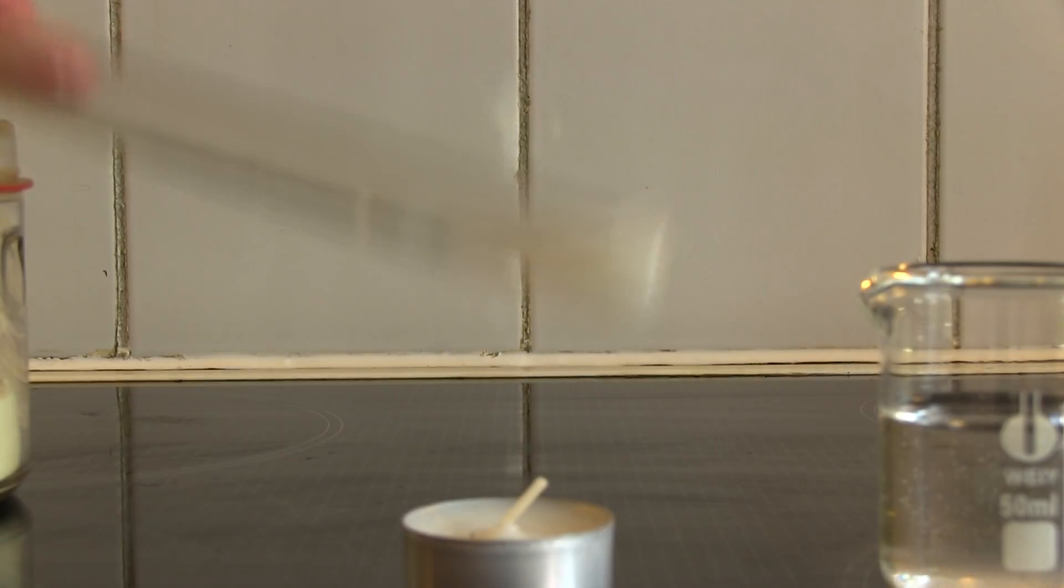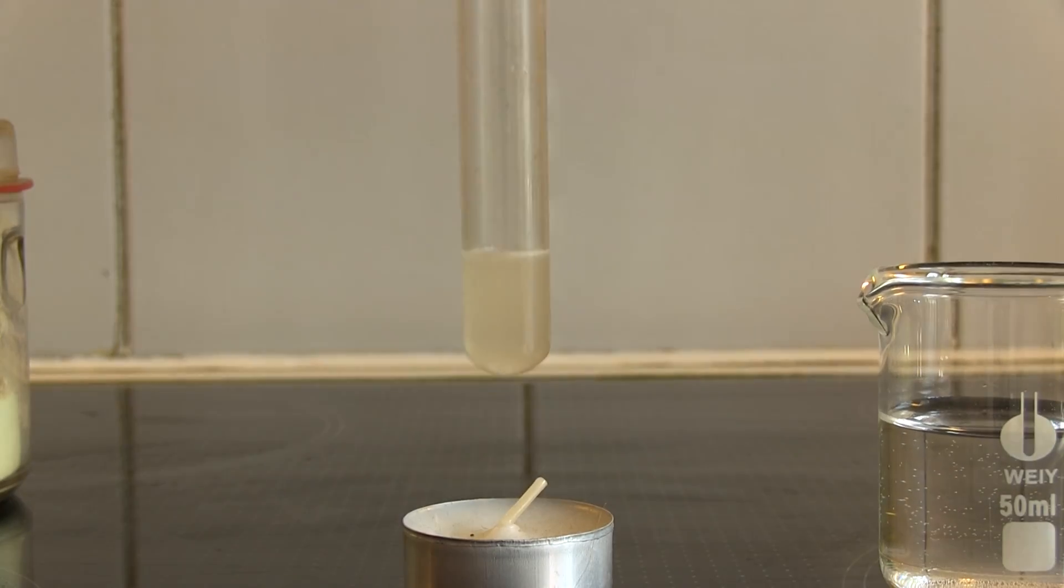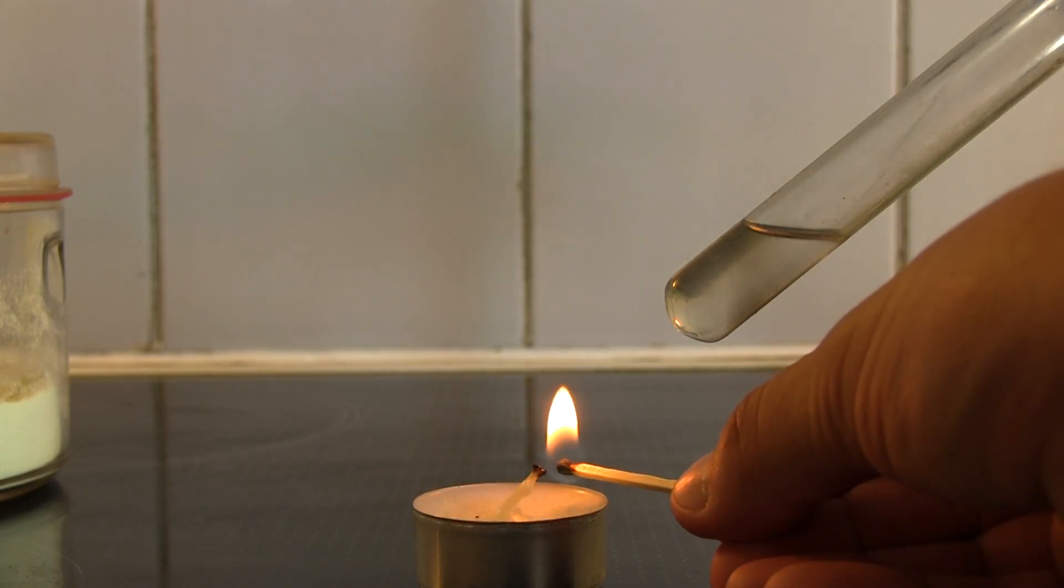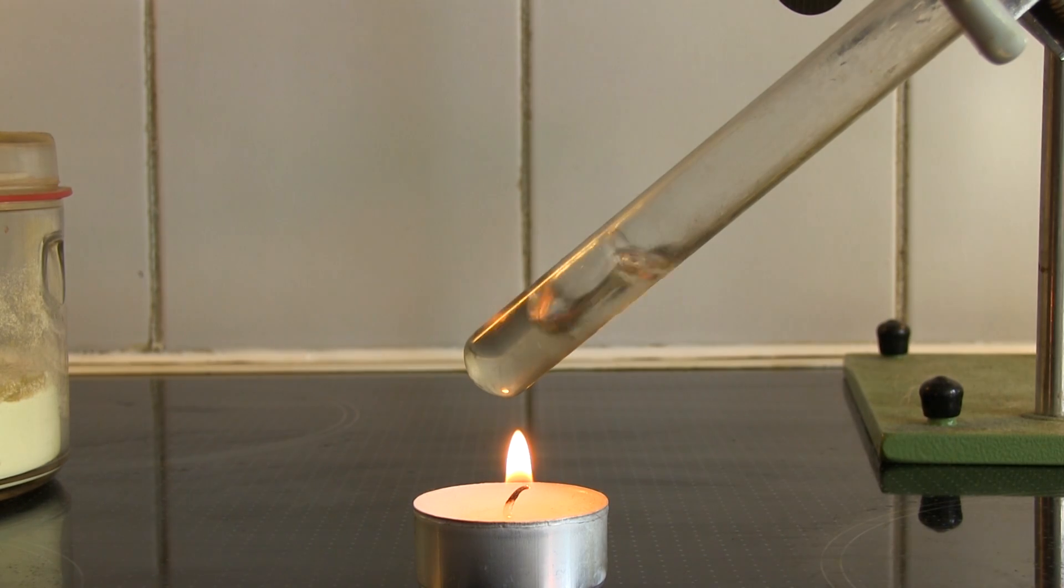First, I'll dissolve the potassium hydroxide in some water, and wait till the water clears. Then, I light the candle, and make sure the potassium hydroxide solution is boiling hot.